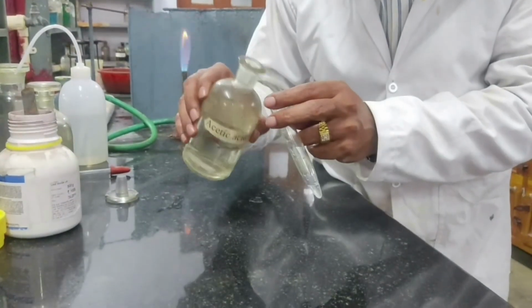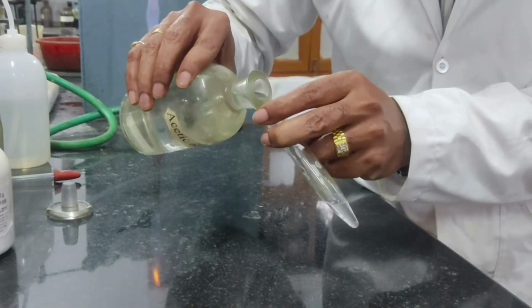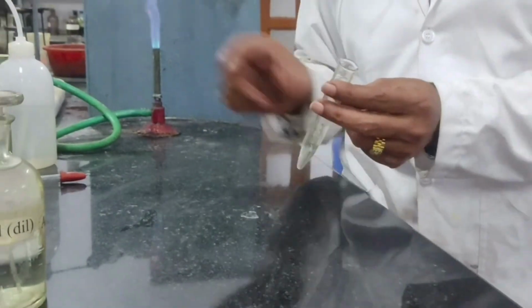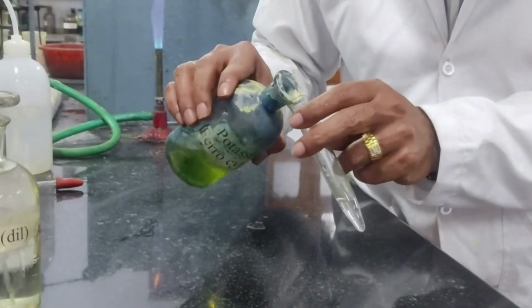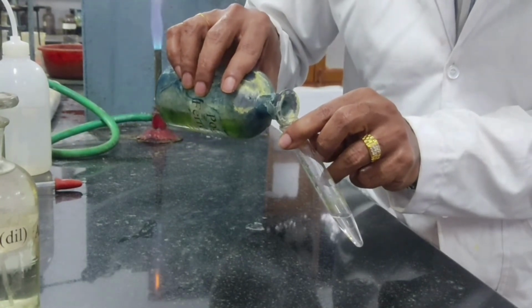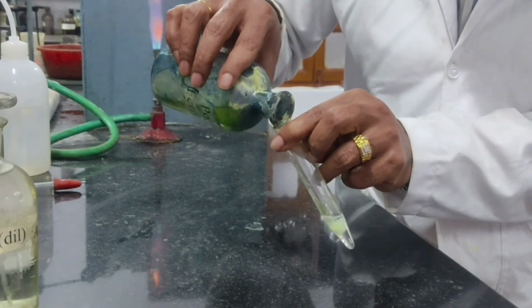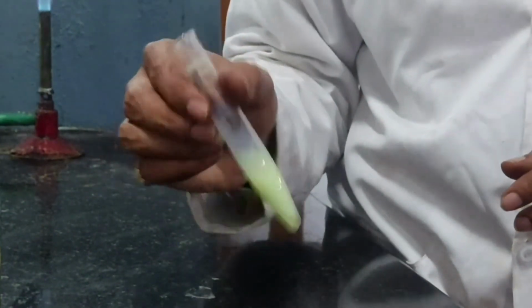For the second part of the centrifugate to test for Zn+2 ion, I am adding a little amount of dilute acetic acid. Then I am adding potassium ferrocyanide solution to this. So this is potassium ferrocyanide solution. I am adding few drops of potassium ferrocyanide solution to this. I must get a precipitate white in color. I am getting a beautiful white precipitate which is indicating the presence of Zn+2. Okay, so zinc+2 is confirmed.